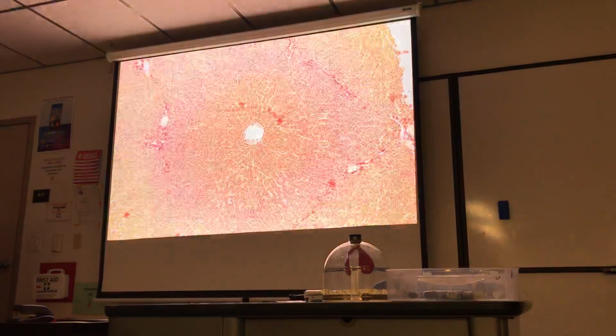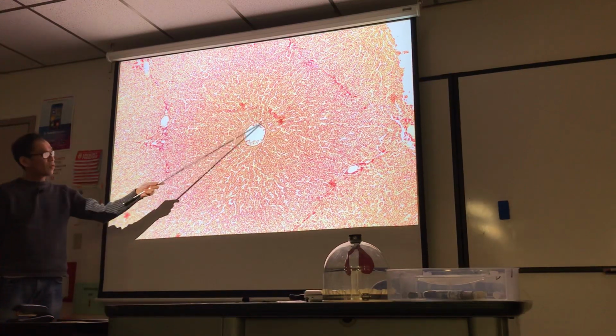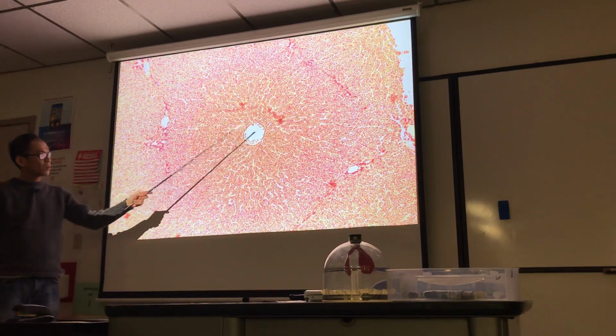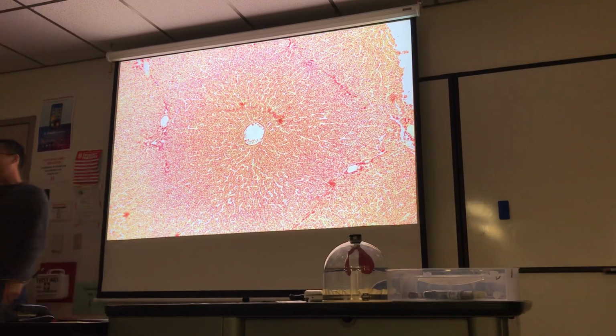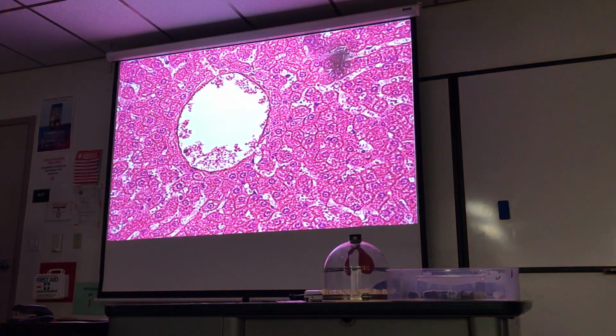There's a venule. The best example of where I know a venule exists is the central venule of a liver. So go ahead and call that a venule. I haven't taught liver yet, but that's a venule. Here, closer up, that's a venule, a small vein.